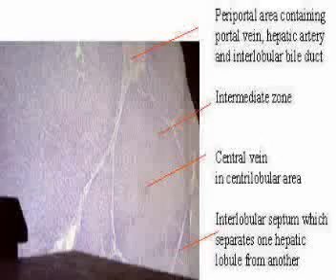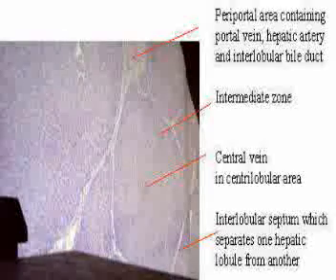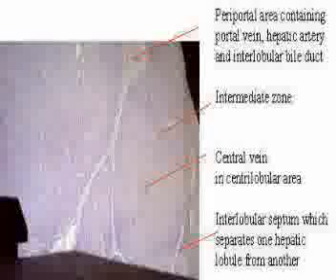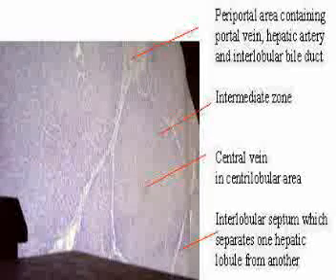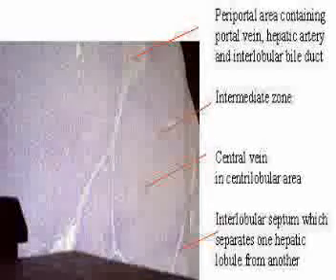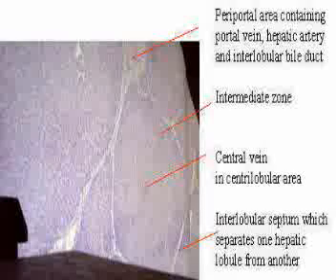Liver is unique amongst all organs of the body, for it is easy to recognize its distinct polyhedral-shaped hepatic lobules, which are the functional units of the organ. Each lobule is separated from the other by interlobular septa and has a central vein to which all the peripheral veins drain. In the periphery of a lobule is a portal triad consisting of portal vein, hepatic artery, and interlobular branch of the bile duct.